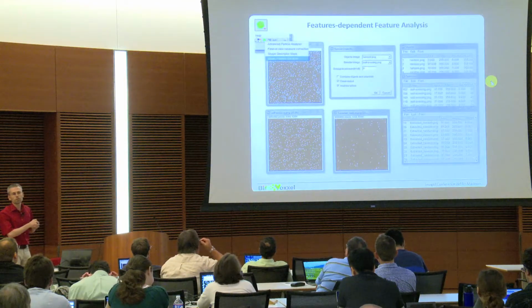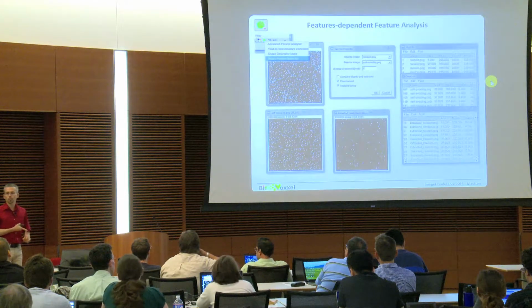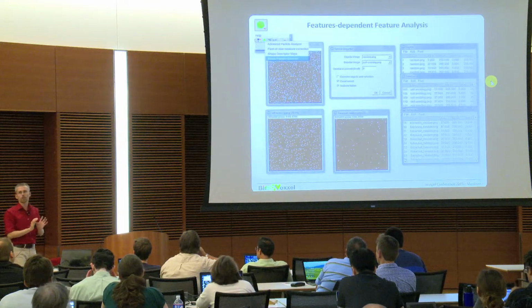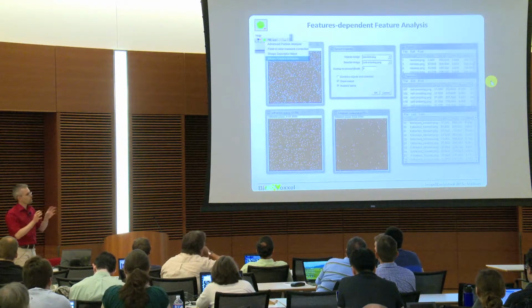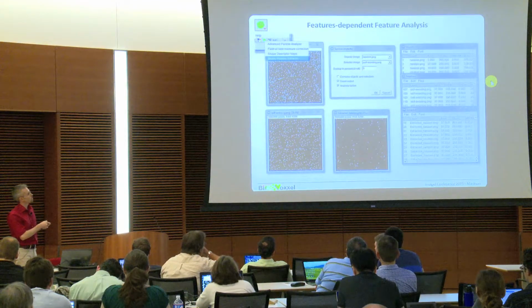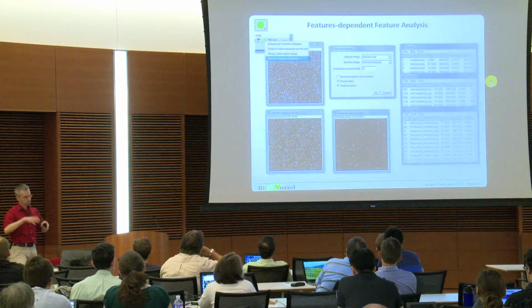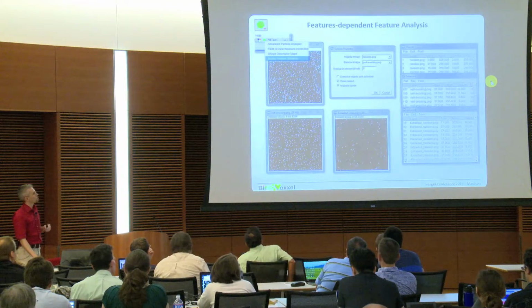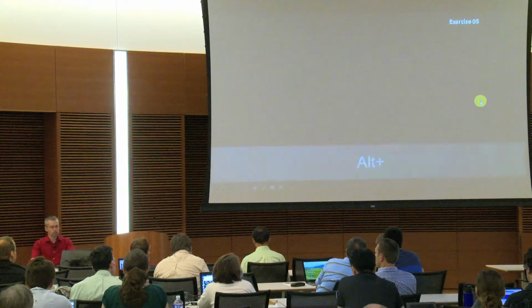This means if you key in 0, it gives you the object as soon as there is a 1 pixel overlap. Otherwise, it checks how much percentage of the selector overlaps with the object, or how much of the object is covered by the selector, actually, and then extracts that. So this is what we will do first, while also having a look at the analyzed particles, and then show you a second possibility for these kinds of analyses.